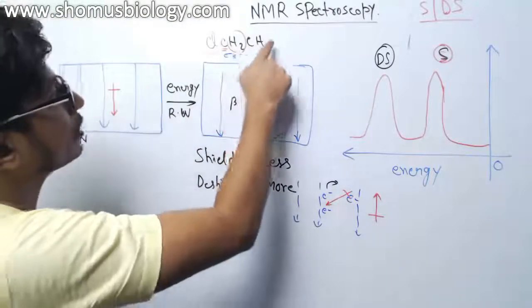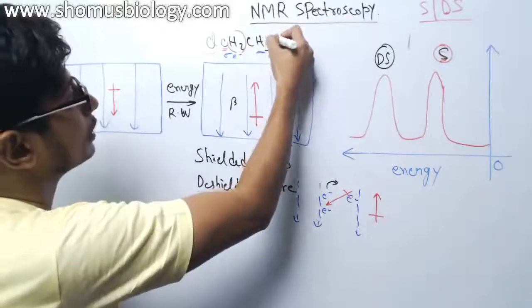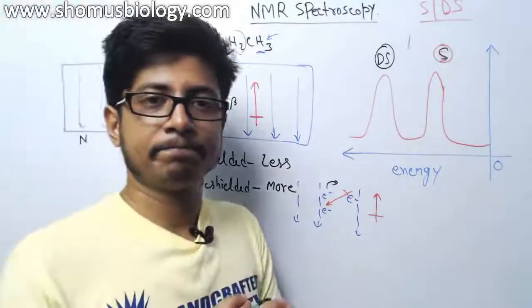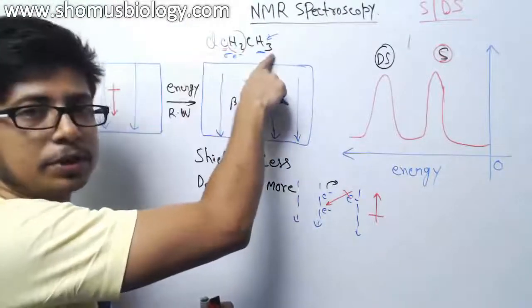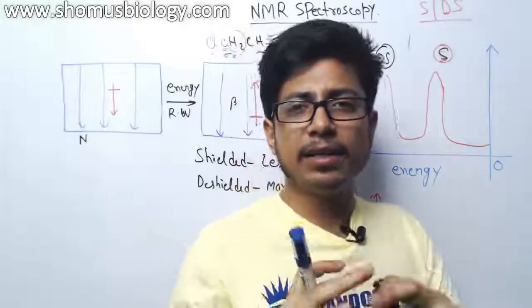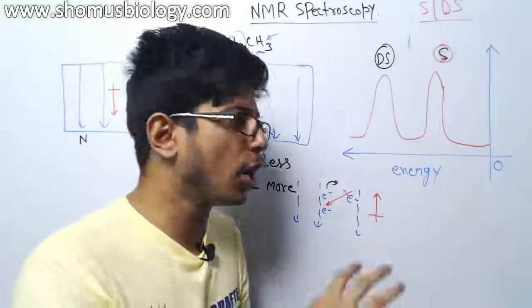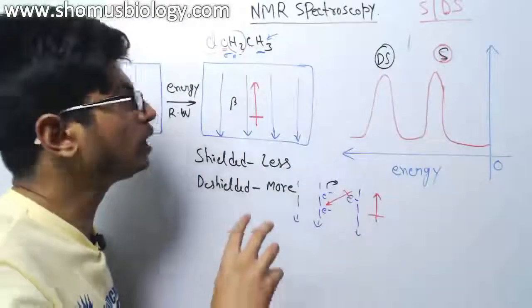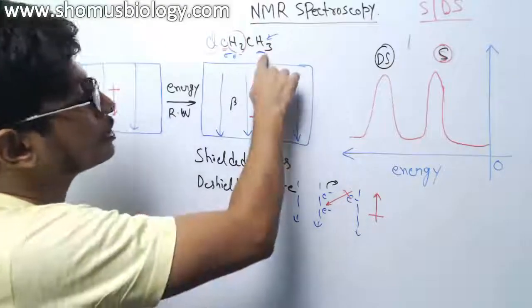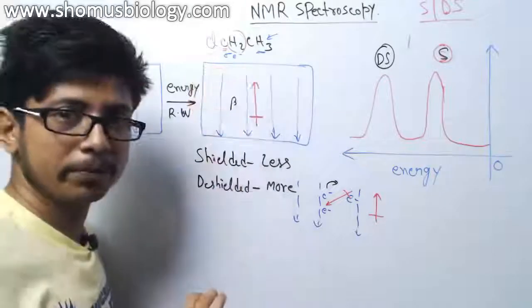And if you take another hydrogen that is present here, this second hydrogen, there is no chlorine, no electronegative atoms nearby. The chlorine is present far from this hydrogen. What does that mean? Electronegativity is a very nearby process. It's a very local process. It is not spread across the whole molecule. It's only spread across a specific region surrounding the chlorine. So this hydrogen does not have any impact from the electronegativity of the chlorine that is far apart from it.